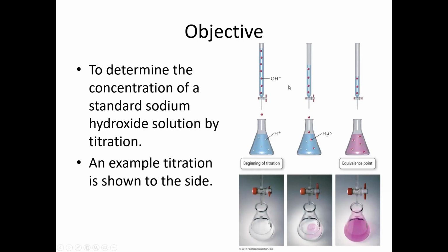And it's very difficult to predict how much is consumed, because depending on the temperature and the pressure on that particular day, the amount of carbon dioxide dissolved in water can be different. We usually just make a rough, approximate concentration of 0.1 molar here, and then we use other chemicals. In this experiment, we use KHP to titrate sodium hydroxide.